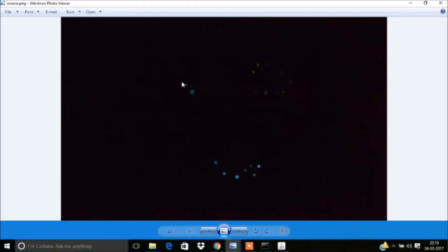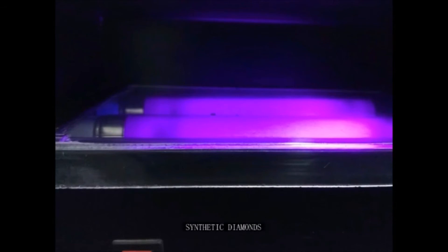Also note diamonds which are marked red color in result image and does not show any fluorescence must be synthetic one.